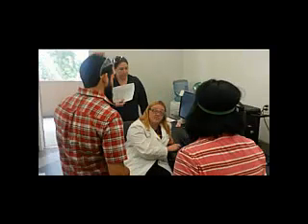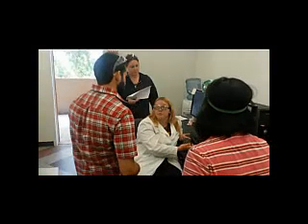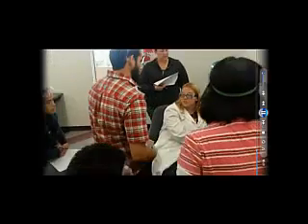Excalibur is the one that waits for contact closure, which is just a little signal that the HPLC sends the MS that says, hey, I'm sending you a sample, wake up. If you do it the other way around, the Excalibur won't start acquiring data until the second run of the HPLC, which will be your clean, which will do you no good. Questions?